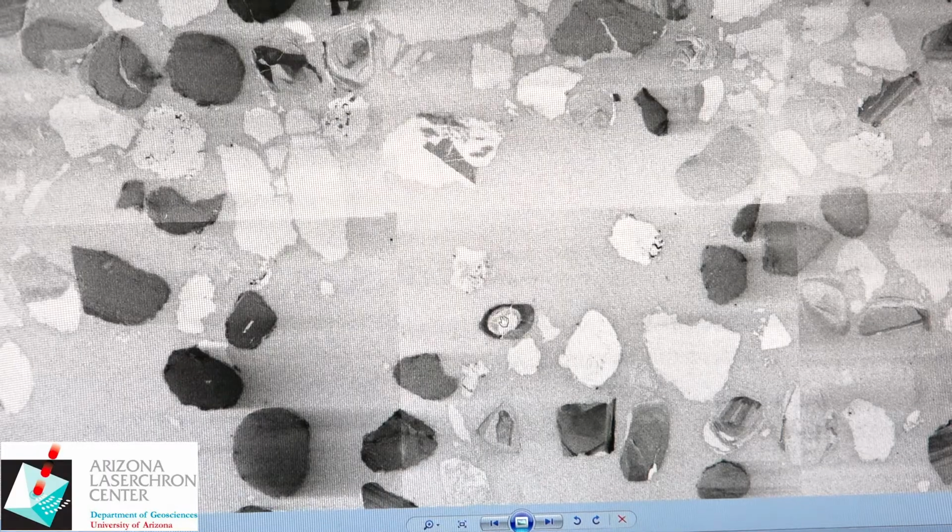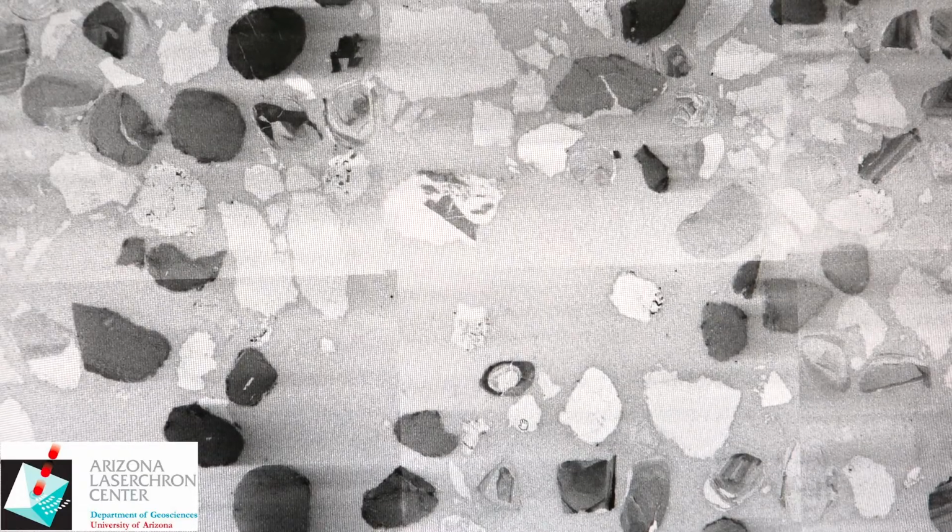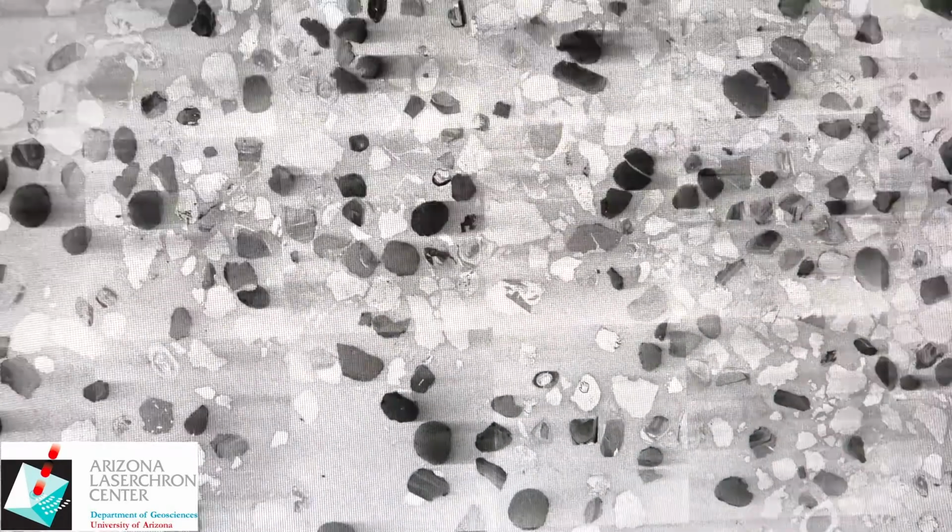Trying to get the final crystallization age of that zircon, it would be useful to shoot the rim instead of the core itself. If you're trying to do provenance work and you have a bunch of grains with a lot of cores in it and a lot of rims, it would be useful to do several rim core pairs just to see what those trends are. For the most part, that is how you distinguish zircon and non-zircon using the imaging we get you.